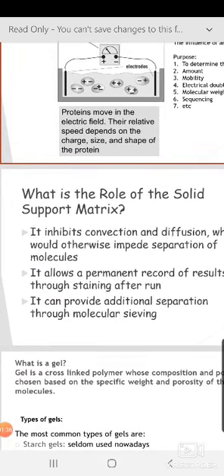Now, I discussed the history of electrophoresis. Initially, scientists carried out free electrophoresis. There was no solid support. Generally in a solution, they checked the movement of blood cells and bacteria, and they measured those movements also. Now they understood there is a requirement of a solid support matrix.